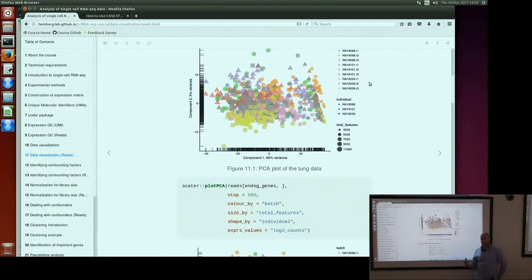We removed quite a lot of noise by quality control, but here, the fewer genes you take, the less noise you will have in your data. So if you trust the top 50, if you look at the genes and you think that they are the most important genes, you can take them. If you don't know those genes, it's probably better to take a longer list of genes. That would be my answer. But in general, it's better to take everything into account.